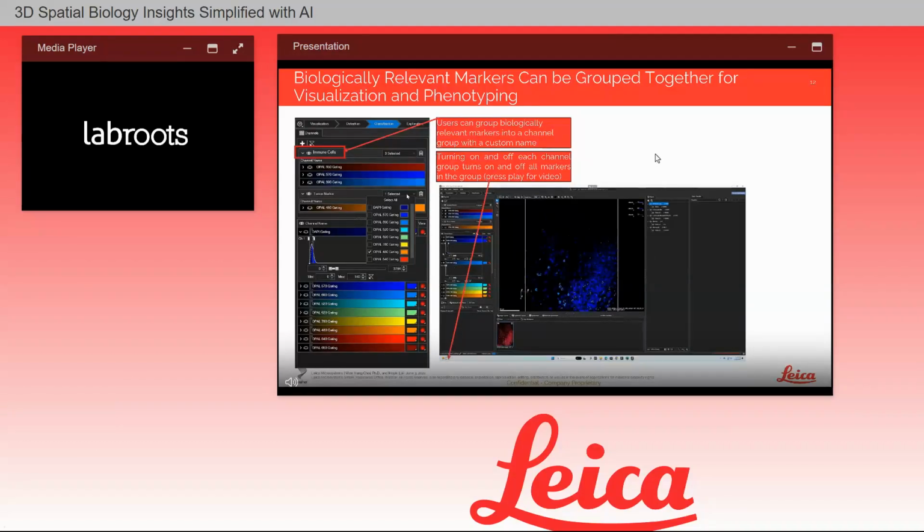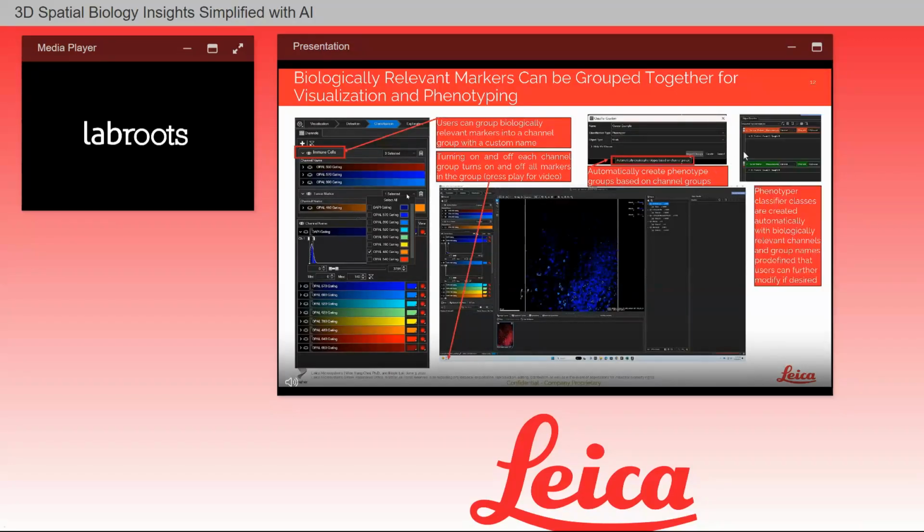So the way it works is when you have a phenotyper interface, you can have import group functionality so that in one go, you can automatically create all the phenotype groups with all the channels pre-selected so that the user can start going with training a few examples right away.